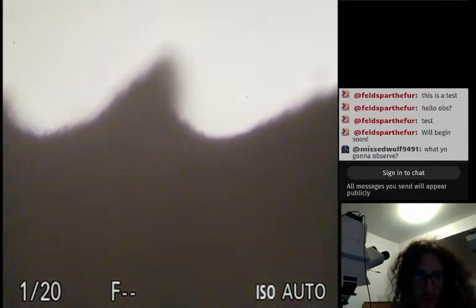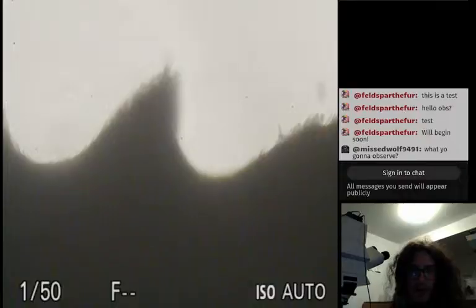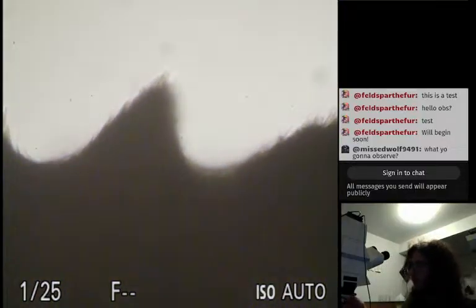This is how light blown out. It's just my camera being rude. Maybe. Let's try it. Yeah, I think it's just my camera being rude, so we're going to turn down the light source a little bit. So maybe a filter. There we go.